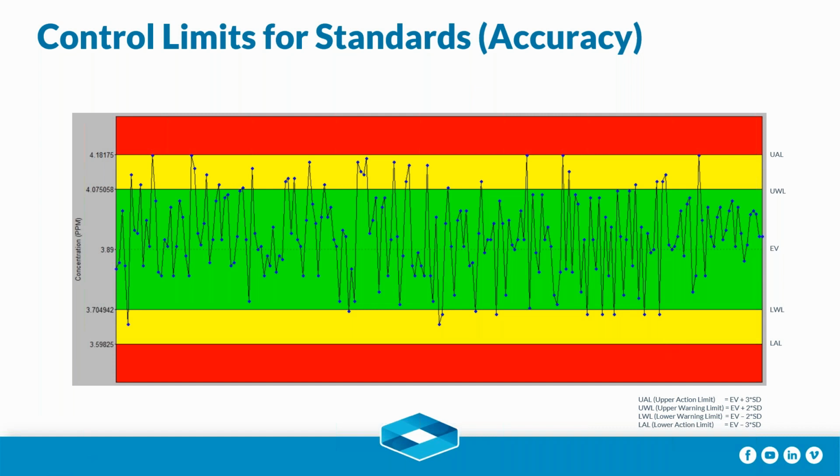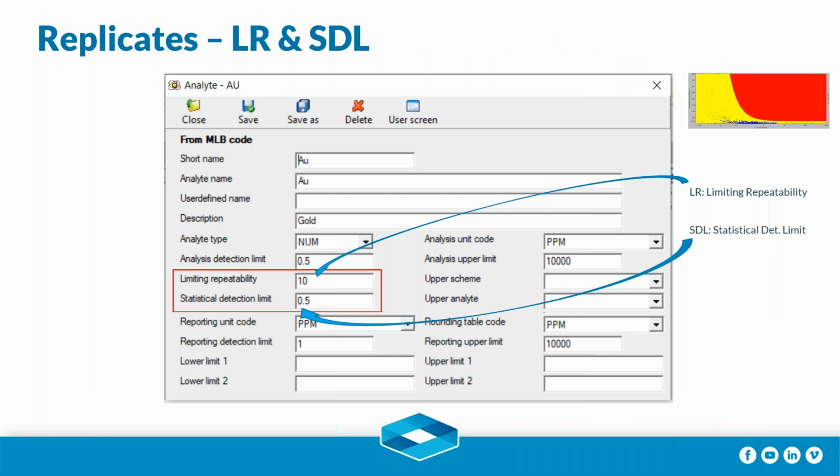All right. So as far as standard samples are concerned, we use those 2 parameters, being expected value and tolerance, which I've shown you how to configure. When we talk about replicate and duplicate, likewise, we also have 2 parameters that control how CCLAS assesses the pass or failure of our replicate or duplicate samples.